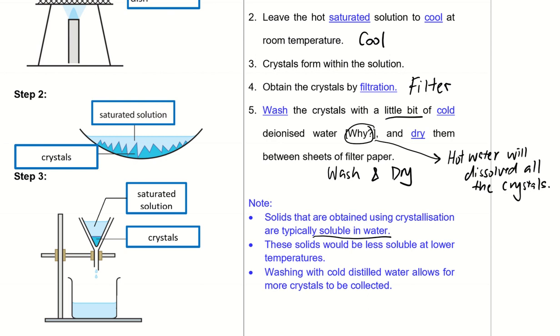appear as crystals. And that's why we need to wash these crystals with cold distilled water to allow more crystals to be collected. Because if you wash with hot water, all our crystals will be gone. Why? Because they will be dissolved.